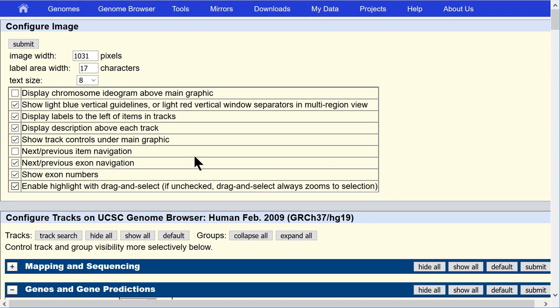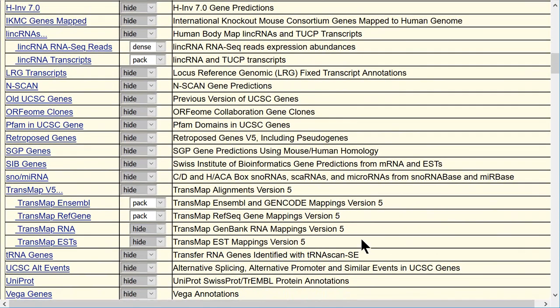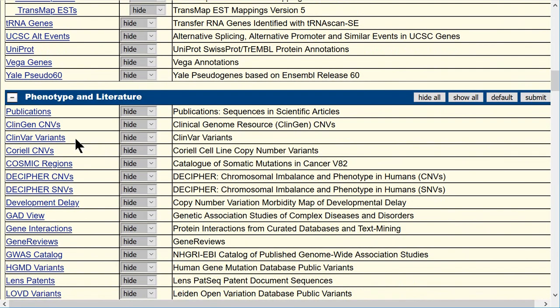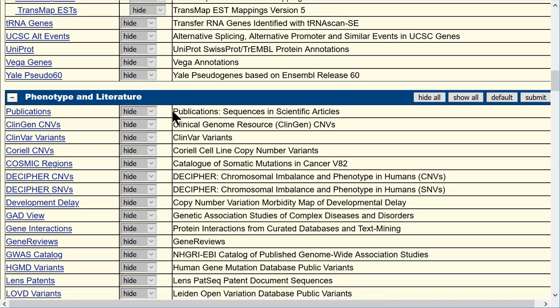Another checkbox on this page, 'show track controls under the main graphic,' is a way to speed up the loading of the browser image. The screen will draw faster if the track controls below the graphic are not shown, but you must come back to the configuration page to turn on any other tracks. On the configuration page you can see the blue bar groups with all the tracks expanded. For each track you have the short label — which appears below the browser graphic near the pull-down menus — and the long label, which is the description shown at the top of the data in the browser image.